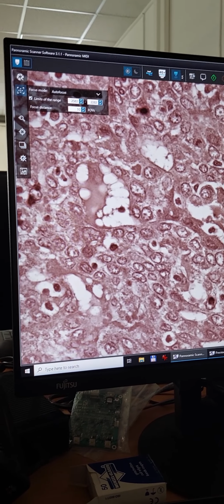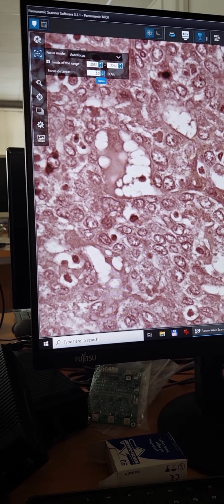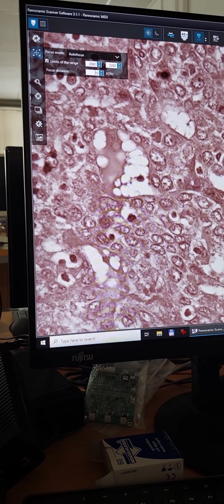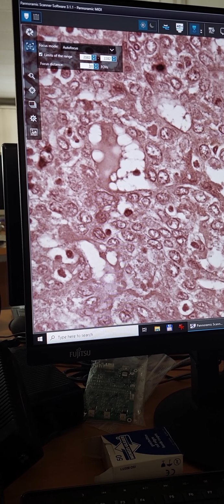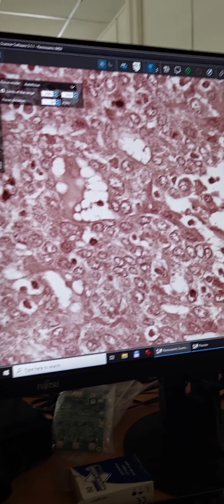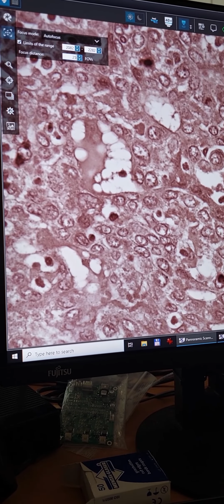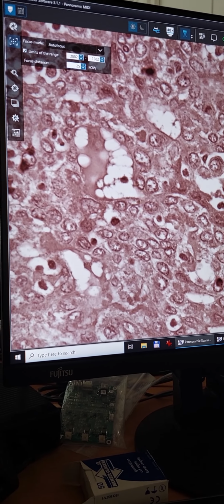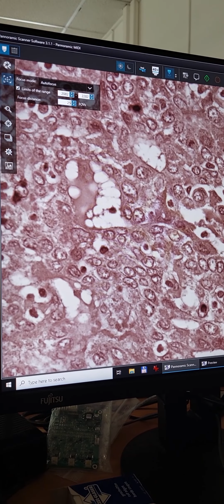If your sample is quite smooth, you can have 20, for example, and that is going to be really good, because it has a cost: building an accurate focus map at very frequent field of views takes a lot of time. If your sample is smooth, you can say, just please examine the focal plane at every 25th field of views. This is going to be quick.